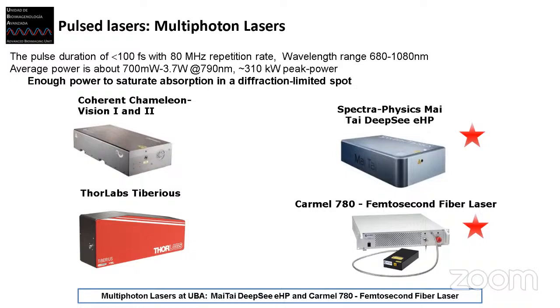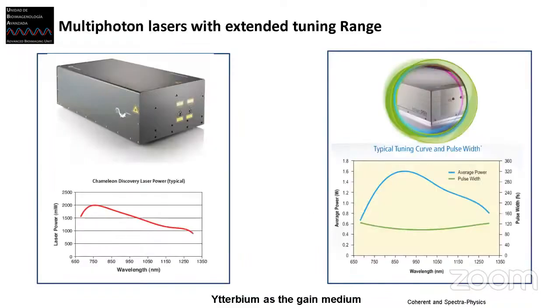So you can excite fluorescent molecules that usually are excited in the visible or in the UV by 2 photons of half of the energy. And I will explain in a minute what this means. But one of the powerful things of this is that 2-photon microscopy is intrinsically confocal. And what is this?